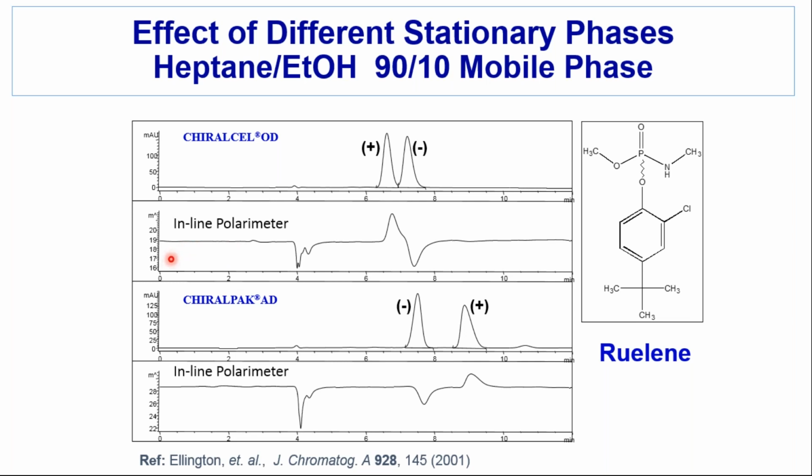So sometimes people will talk to me about the first isomer, or first enantiomer. That's not a physical property. It depends on which stationary phase you're using, or mobile phase, as we'll see. This can present a problem with racemate. You don't necessarily know what the order of elution is.